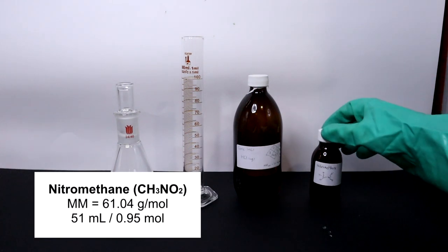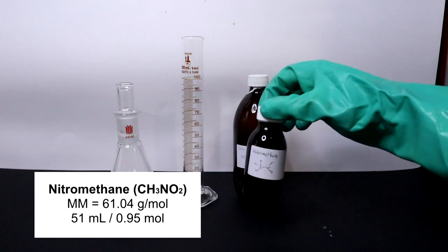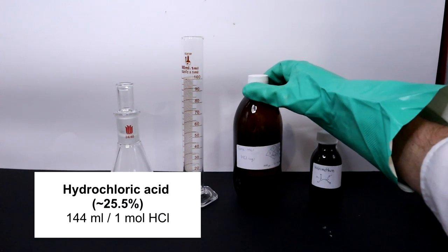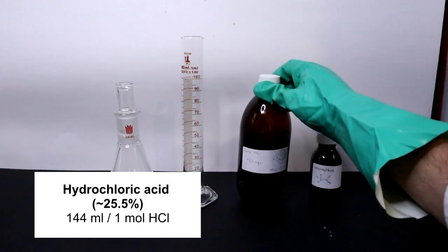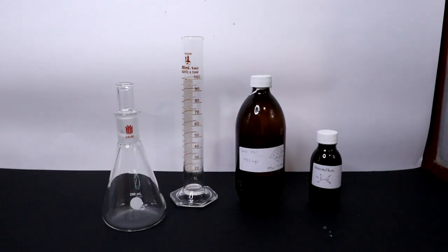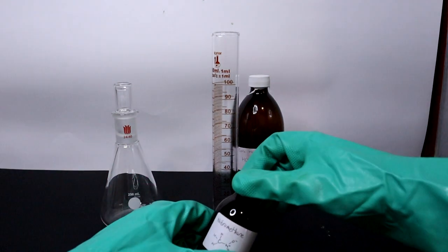In this procedure I am using 51 milliliters of nitromethane, which is just shy of one mole, followed by 144 milliliters of 25.5% hydrochloric acid. My idea here was to use the highest concentration of hydrochloric acid while ensuring that the boiling point of the mixture remained near 100 degrees Celsius.